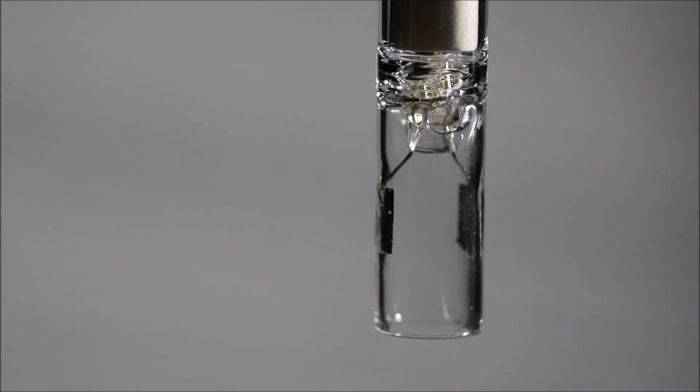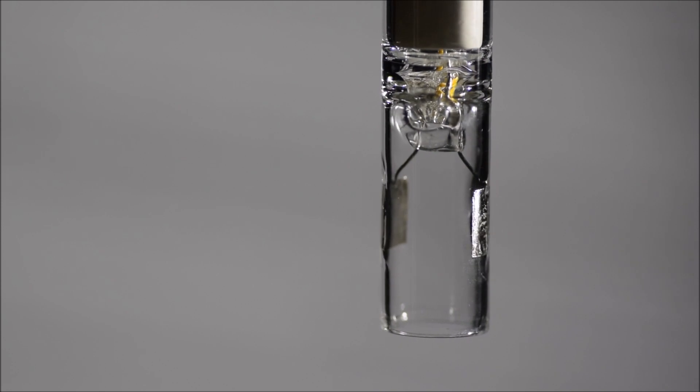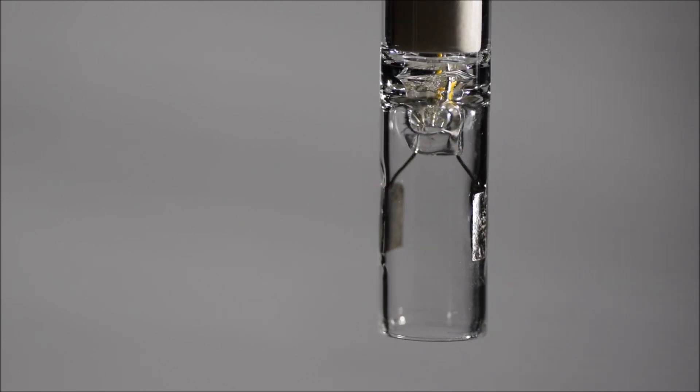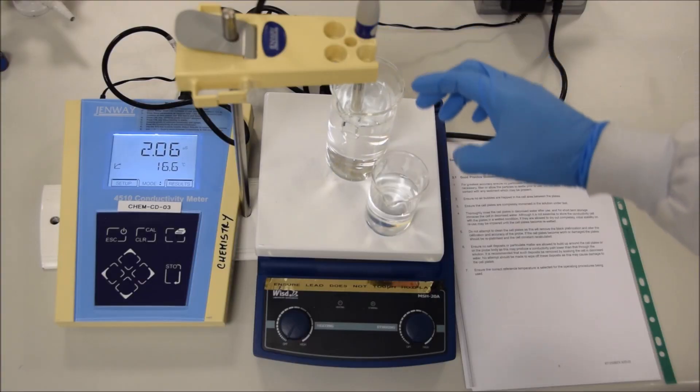So this is what your probe looks like. It's basically composed of two plates that are coated in platinum and it measures the conductivity between those two opposing plates.